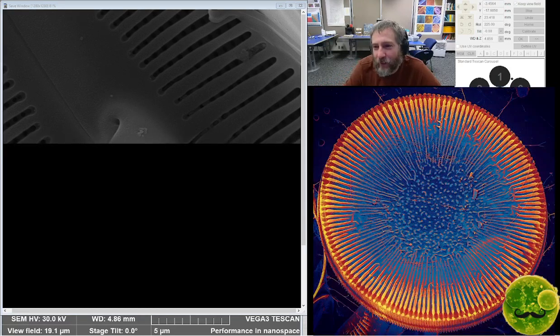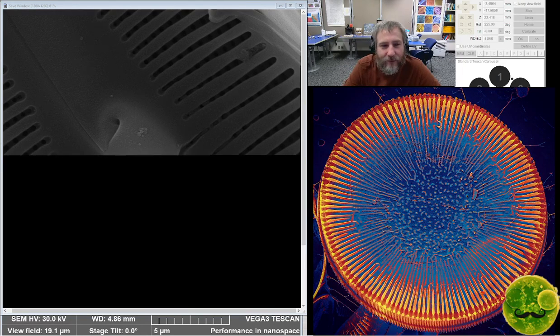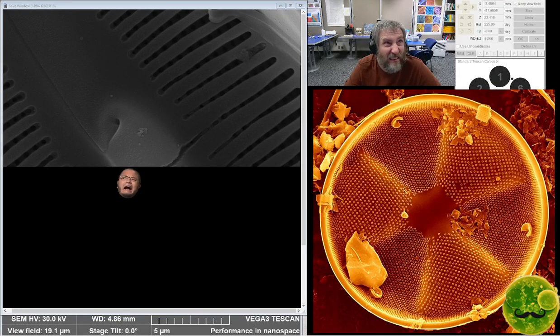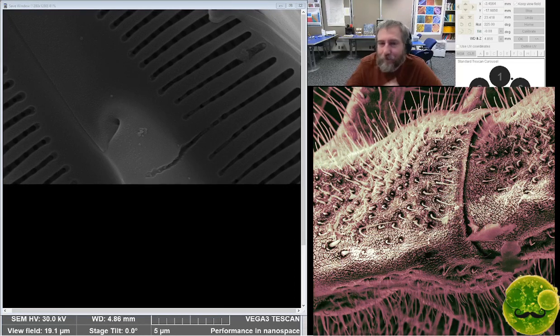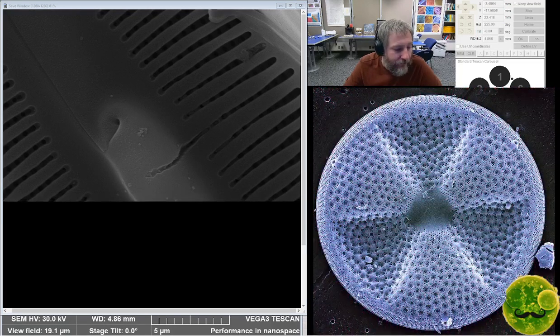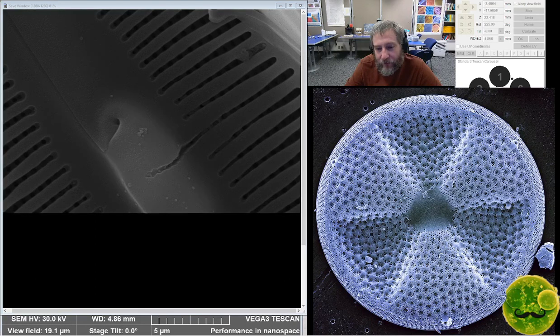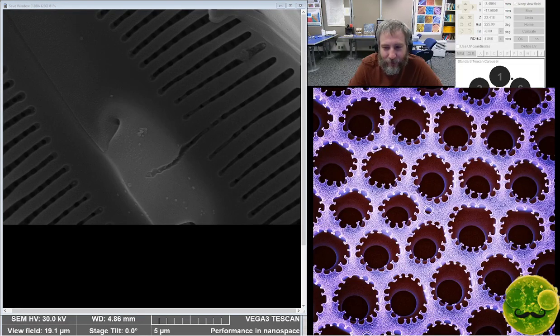It's not broken, cobalt. That's just the way it looks. And Orange Boy, have I found new ones from Africa? Yes. I'm in the process of describing 5 new Afrocymbella, and I think we have 9 new Diploneis, and we might actually have a Capartogramma that we don't know what the species is, but we haven't described yet. And then I'm pretty sure that Itzy has shared a lot of her collection with another diatomist, and they've looked through them, and I think they believe that there are hundreds of new species.